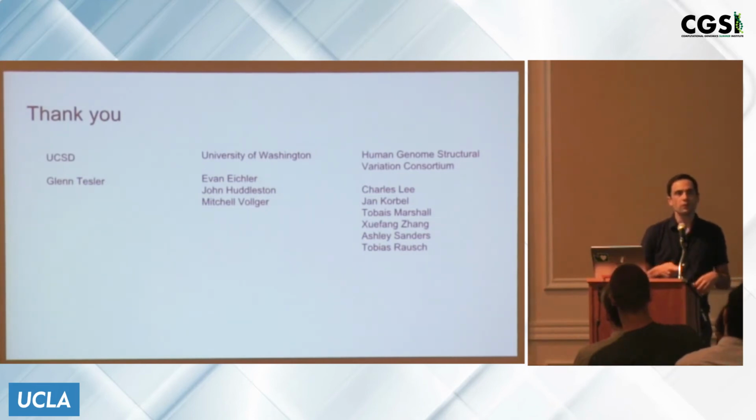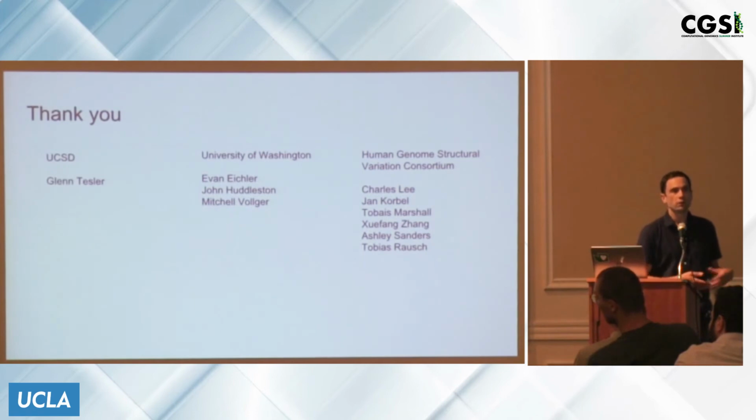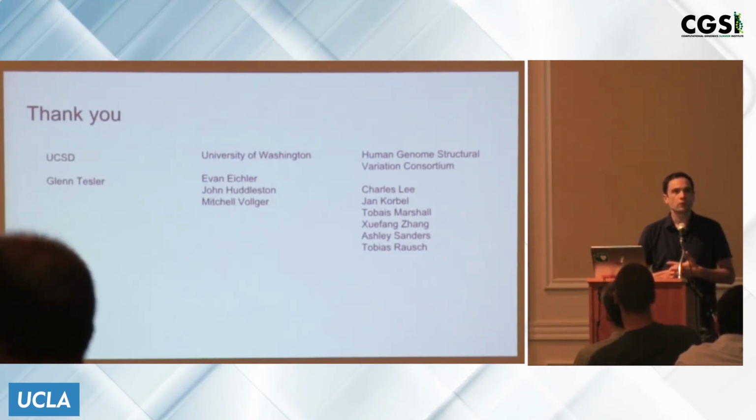Essentially, one of the things one could do is use the Illumina calls to inform whether the methods aren't working quite as well in the emerging PacBio approaches, or sorry, SMS approaches. By and large, you can show that for essentially any variant that you can find with Illumina sequences, there's more than enough information content in single molecule sequences to find those variants as well.